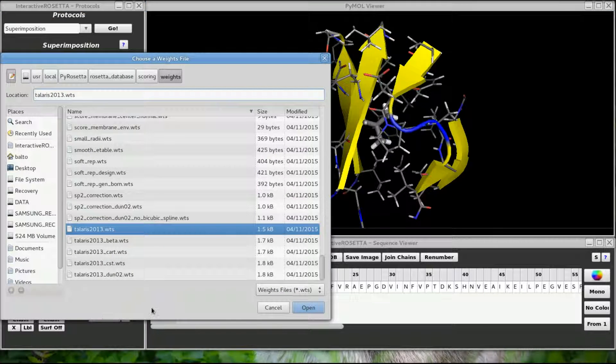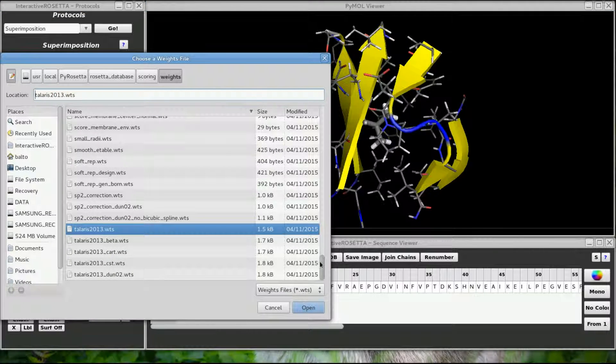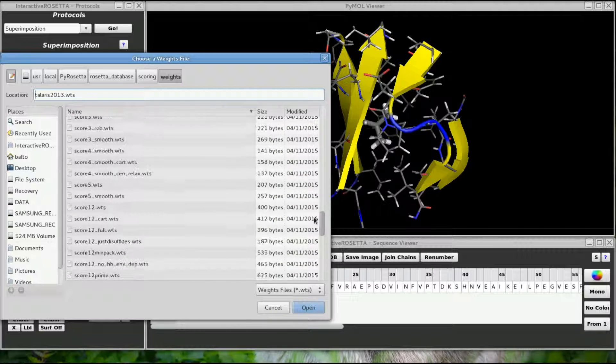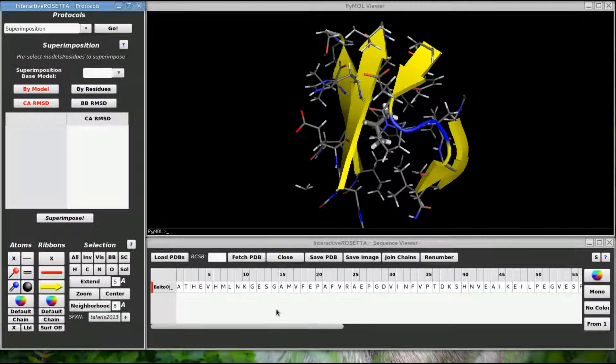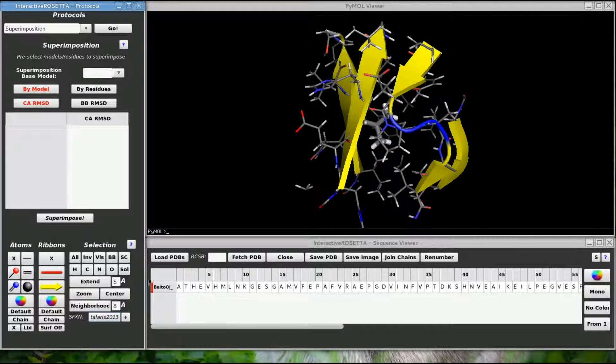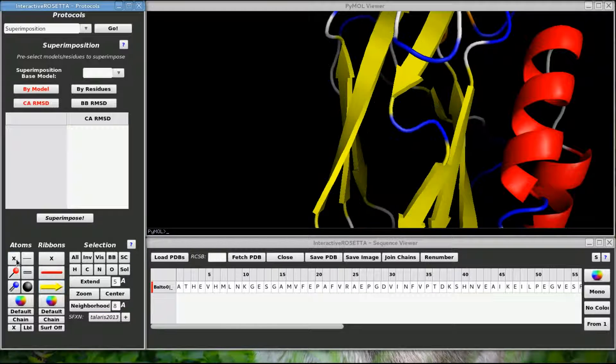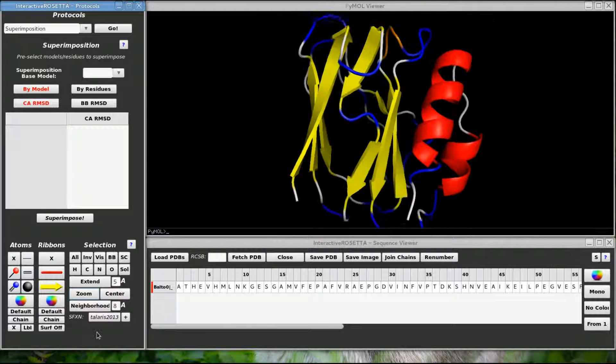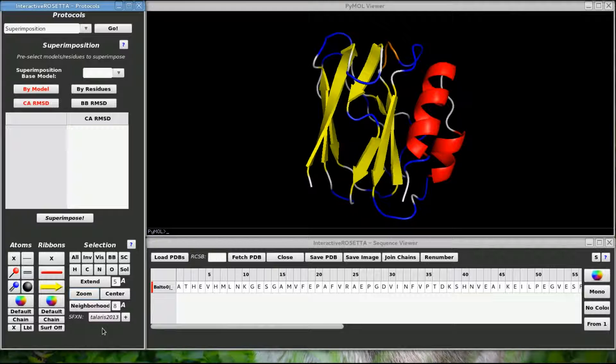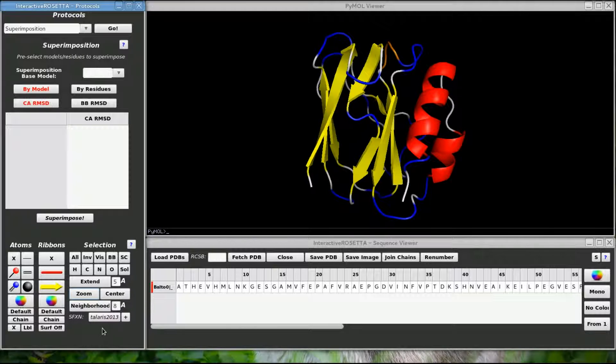This button down here allows you to change the current Rosetta scoring function. Unless you are someone who really knows how to use Rosetta well, I would not recommend changing this setting. When the Rosetta developers modify their primary scoring function, I will update the defaults and release a new version of Interactive Rosetta.